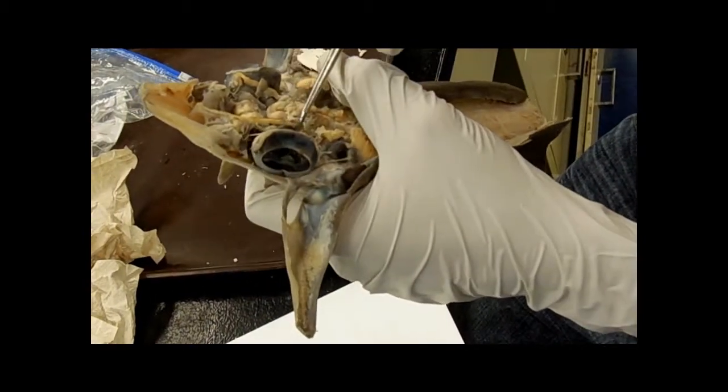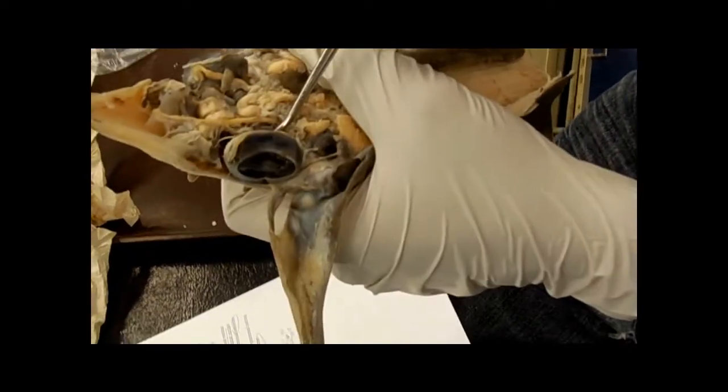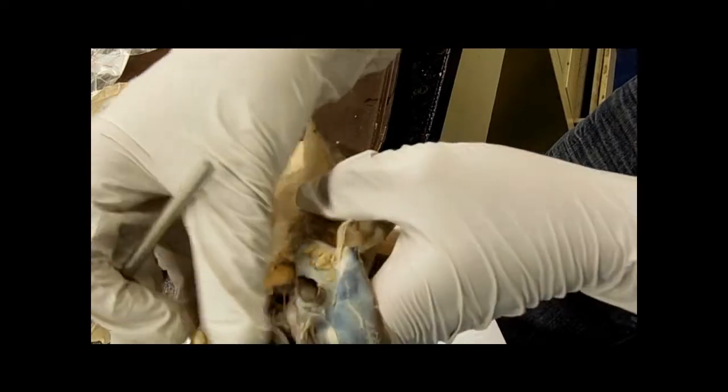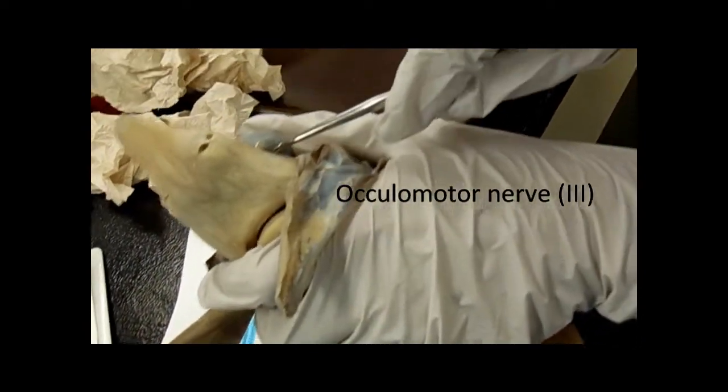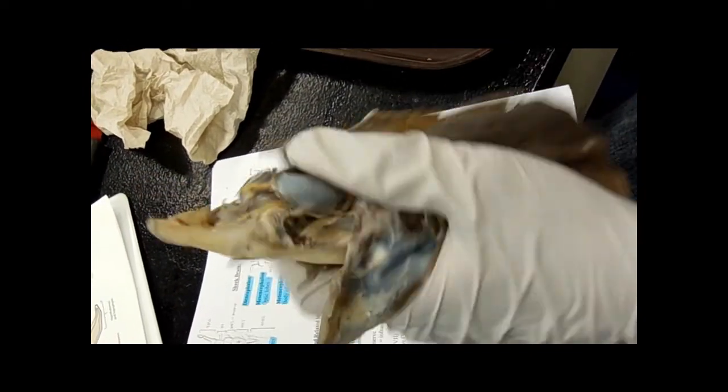So you remember how we had the one that runs along the surface of the eye, the deep ophthalmic nerve. You have one similar to that, how it runs along the surface of the eye, right here. This is the ocular motor nerve.